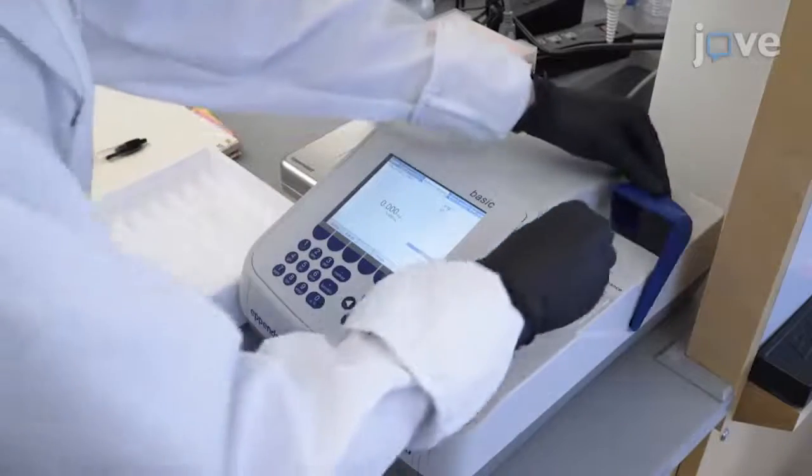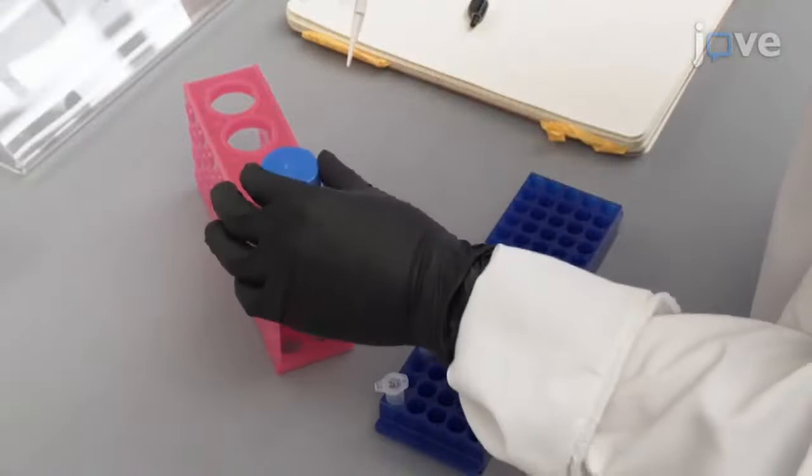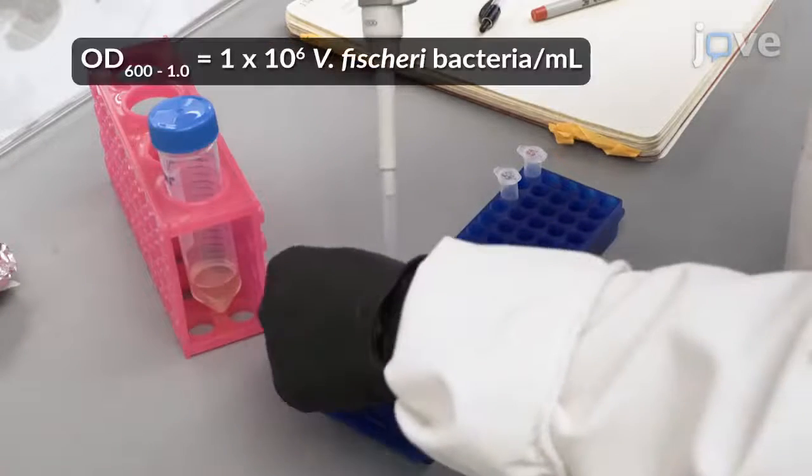Measure and record the optical density at 600 nanometers for all samples. To obtain an accurate OD measurement, dilute the samples up to 10-fold using LBS broth. Then normalize each sample to the desired OD 600.